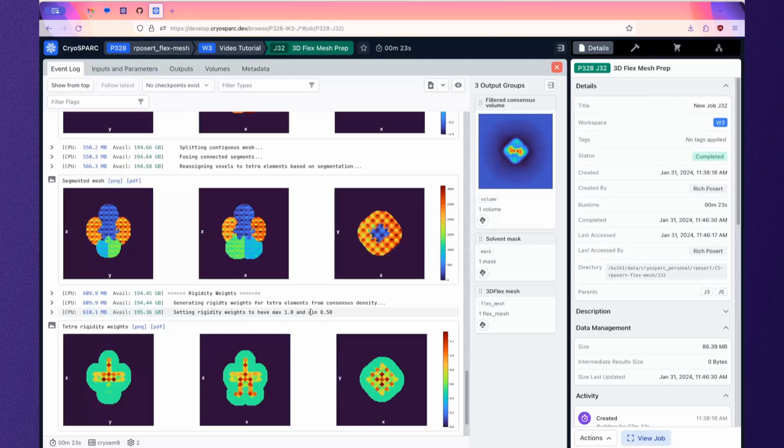And then we discussed a lot about what it means to fuse segments and different strategies for how you might perform these fusions and when you might want to leave things unfused, and especially how that interacts with rigidity. To summarize that part of the video, you want to perform fusions in a way that retains flexibility you care about, while being careful not to unintentionally restrict the edges of your segments.